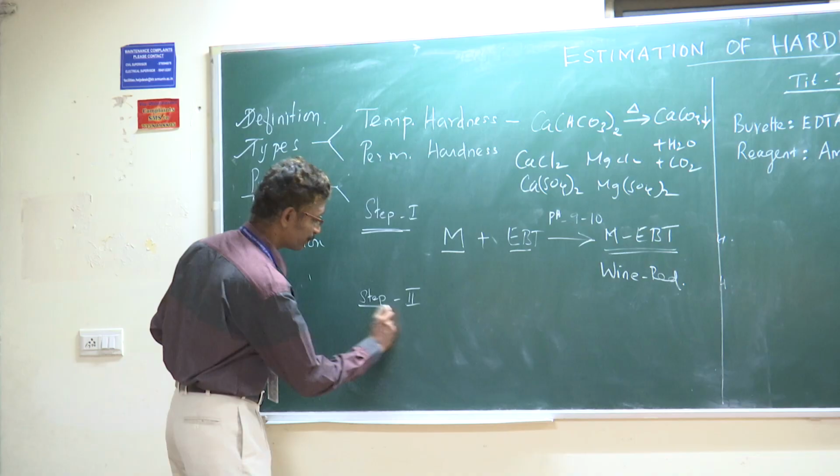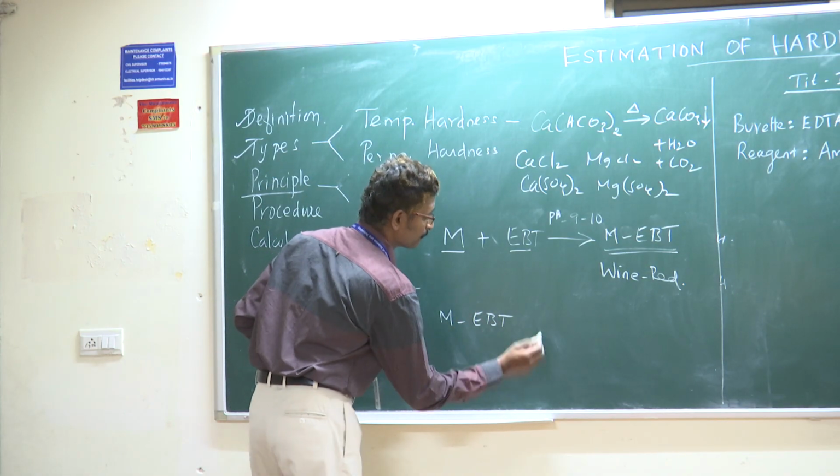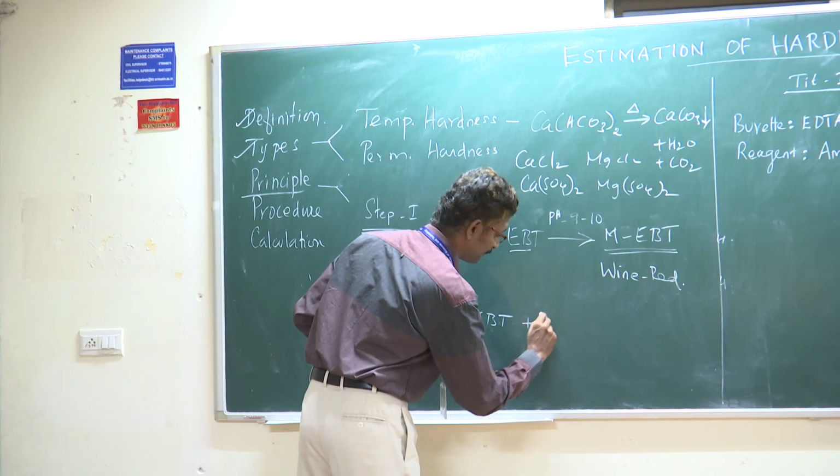In step 2, this solution, M-EBT, is titrated against EDTA.